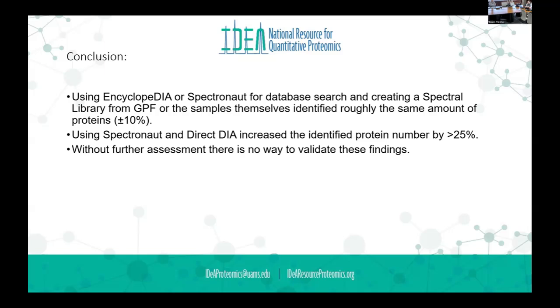Dennis and I were talking yesterday about the plots of DIA-NN or Spectronaut on significance. I said what we probably should do is have two outputs, run it on both, and report the union of the significance and the intersection, and start with the intersection. If you can't find an interesting biological story there, then back up to the union, or look at the union for the hypothesis that you were going to go after. But the intersection is likely where the real differences lie.